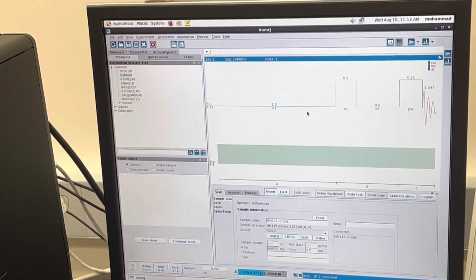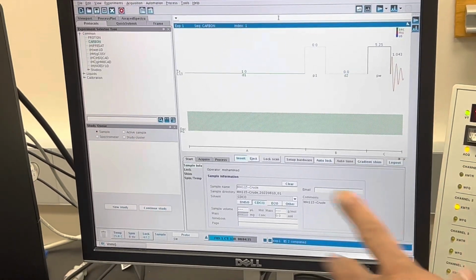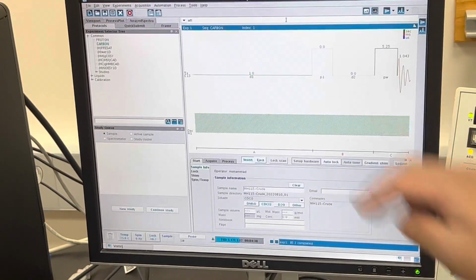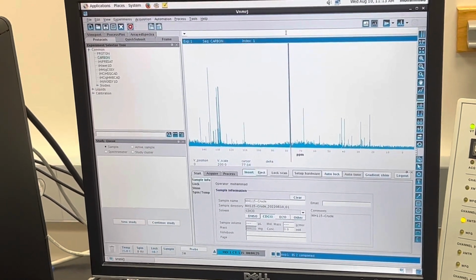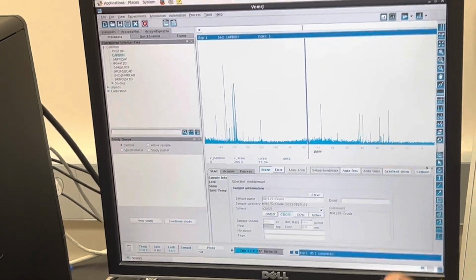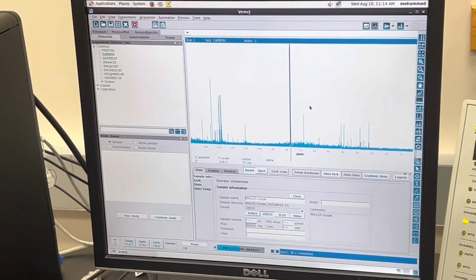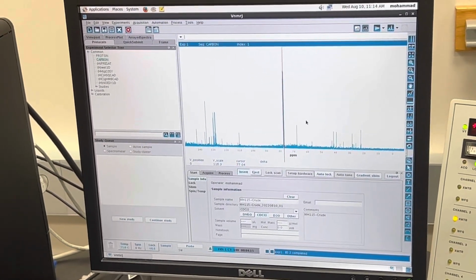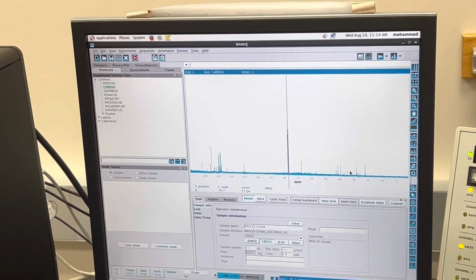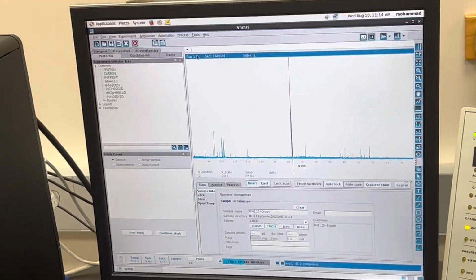Once you run the carbon, you can also check in between with WFT while it is running. If you type WFT and press enter, you'll see the situation of the carbon. The experiment is not done yet, but WFT shows you the result of the scans so far. If you have a more concentrated sample and WFT shows that it's good enough, you can stop the experiment, eject it, and take your sample back.